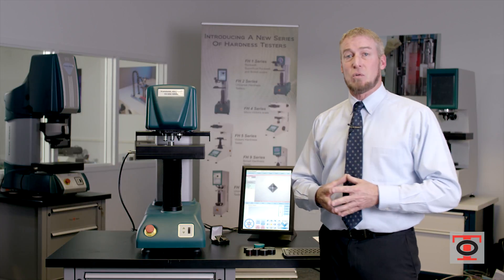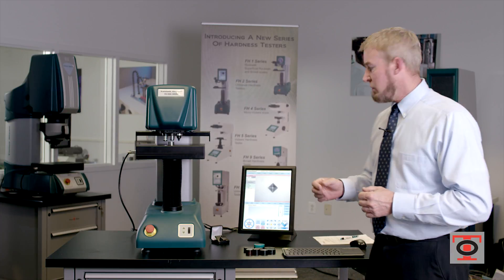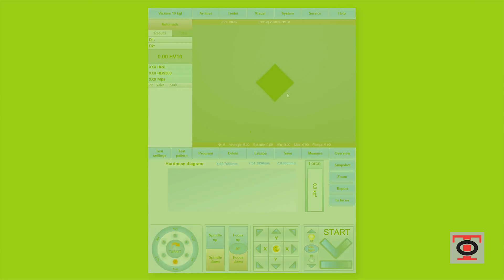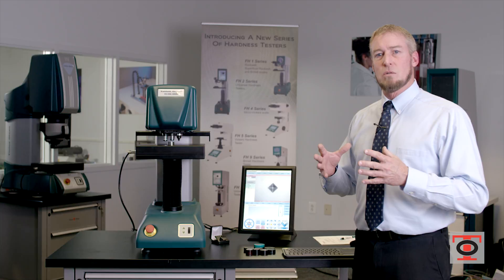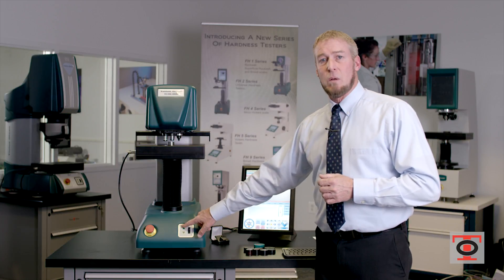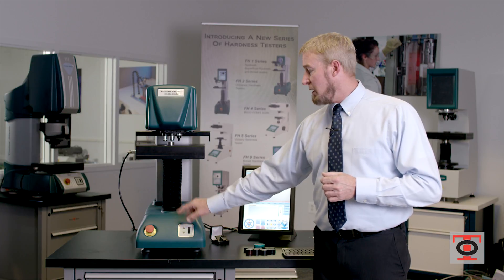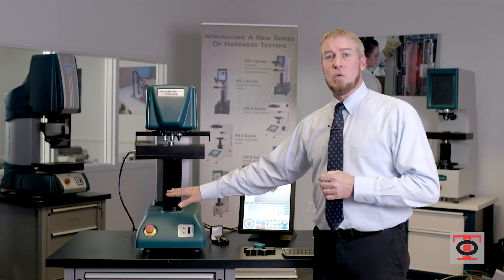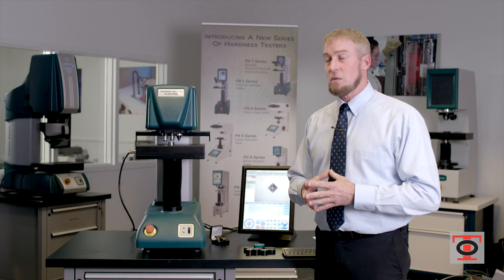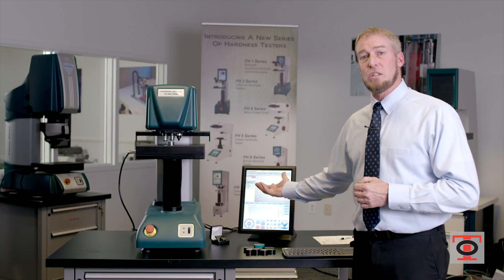We now have a 5 megapixel camera installed in the machine through each objective, and it projects what you see. So now I have a non-focused indentation, and if it was drastically out of focus, I would use these two buttons here — up and down. This is a graduated, two-speed, fast movement of the Z-axis or the spindle, moving up and down to gather focus. I would use this to get close to my sample, and I'll see that by the light getting brighter on my screen.